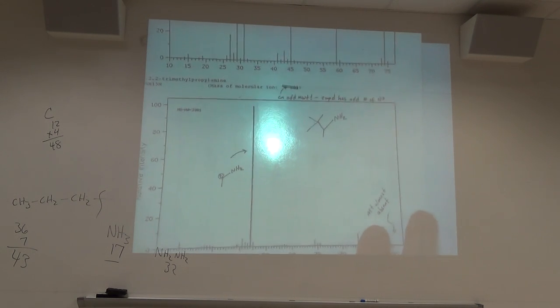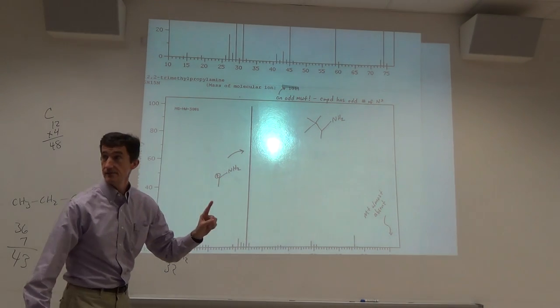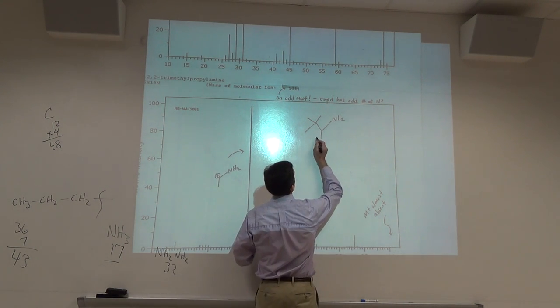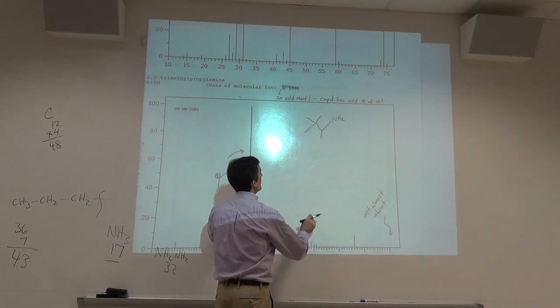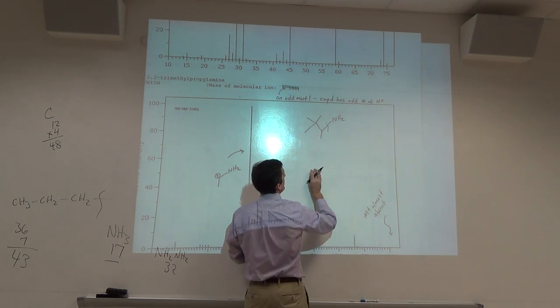Okay. What type of cleavage do we expect here? It starts with an alpha. Where do you want to cleave here? You want to put the cation where? Next to a lone pair, an atom next to a lone pair. Do we want to cleave here? No.